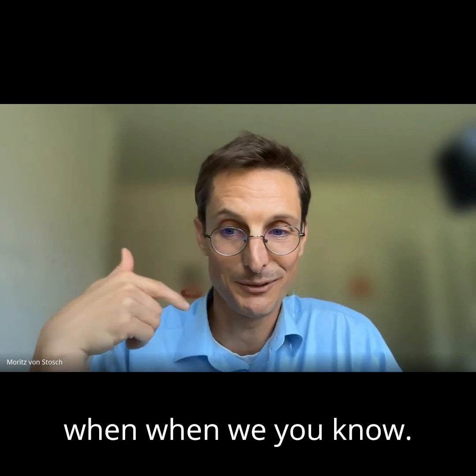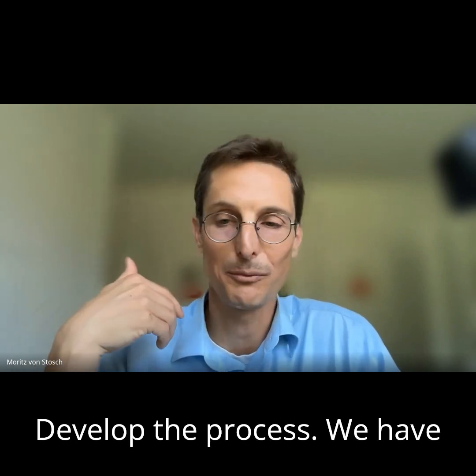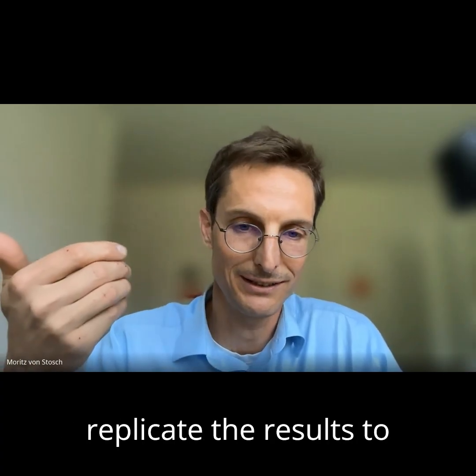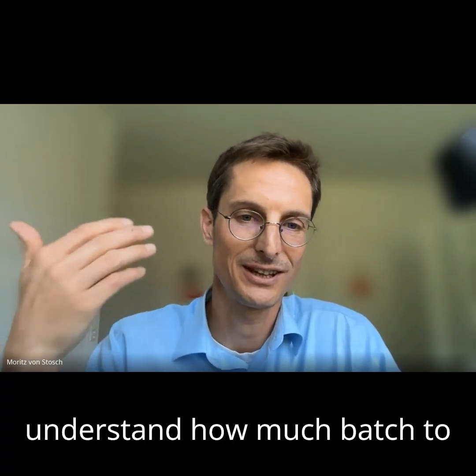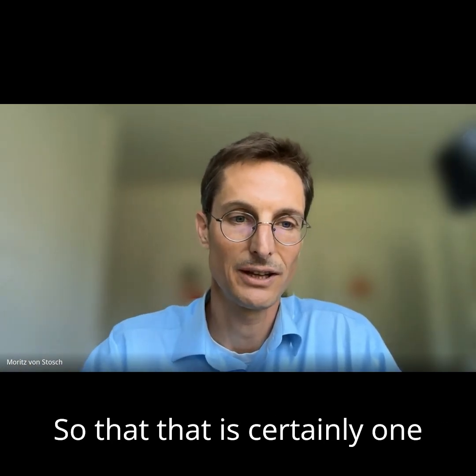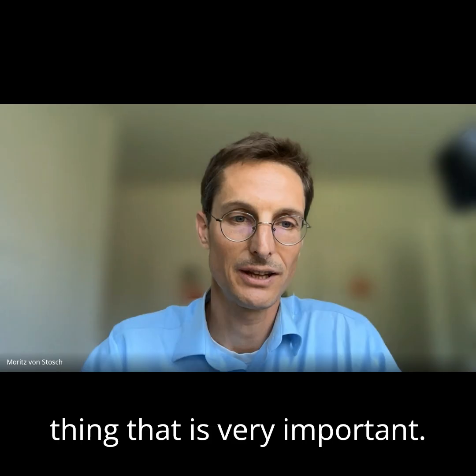And second, when we develop the process, we have enough experiments where we try to reproduce, we try to replicate the results to understand how much batch-to-batch variation we have. So that is certainly one thing that is very important.